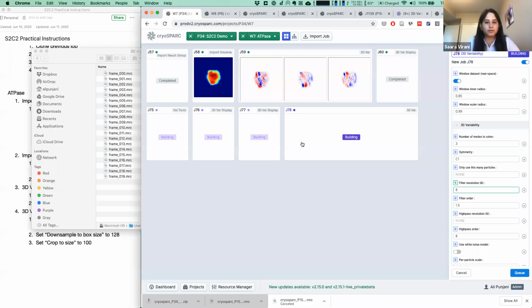Thank you. Those are all the questions we have on 3D variability. I do have one question also regarding that fact on cooperation and coordination between these. Should we think of each of these components of variability as being uncoupled and discrete from each other? Because if they were coupled, then they would be a different kind of flexibility that would show up as the combination of all those. Are they really to be thought of as uncoupled and uncorrelated?